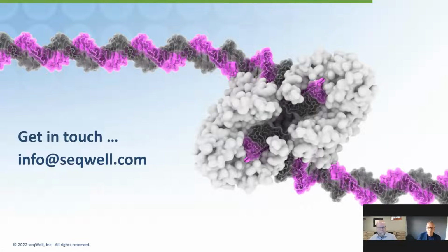Great, thank you. Next question here asks, TN5 transposase seems to have a lot of applications. Are there areas where tagmentation is not appropriate?